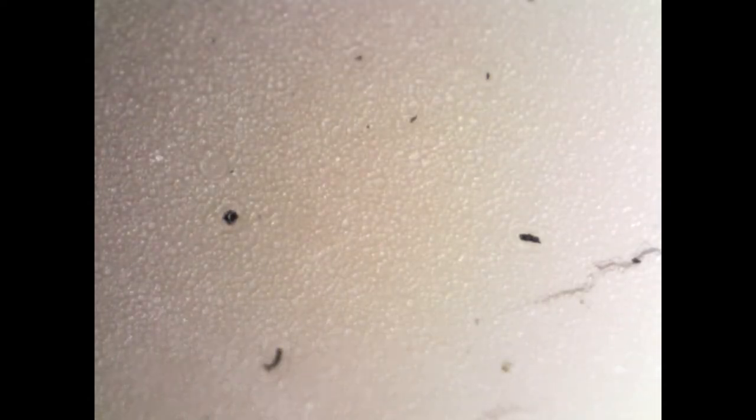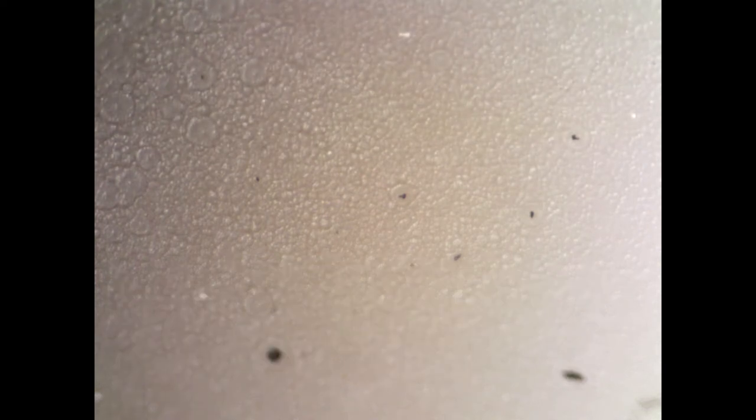You can see here, there's quite a few spots. There's that couple down the bottom there that have bridged with the black smear. Maybe it's two or three that have come together. There's a group of three. These ones are almost like the underside of lily pads, in the middle left, now bottom left.